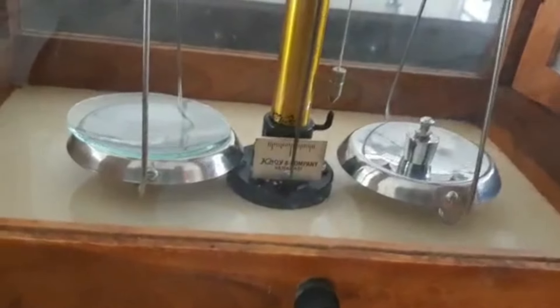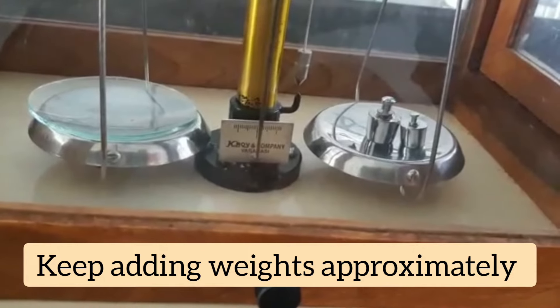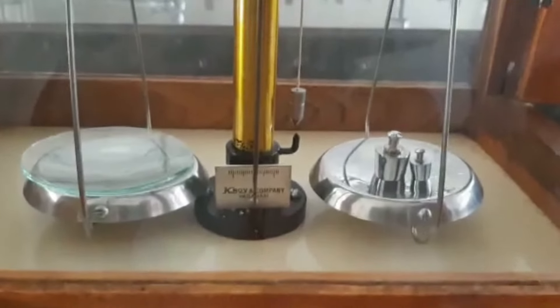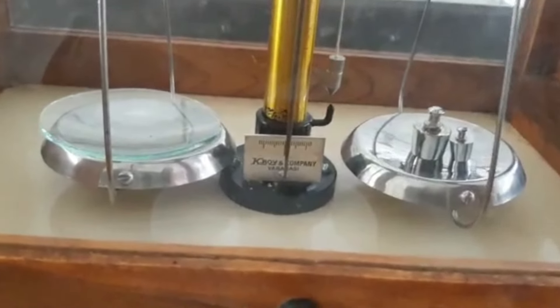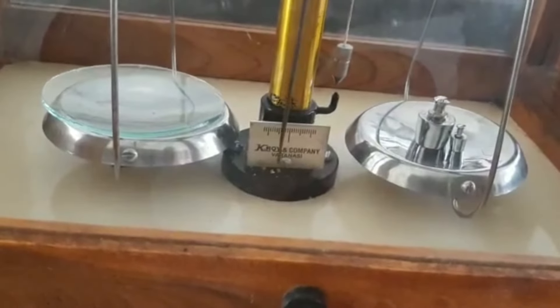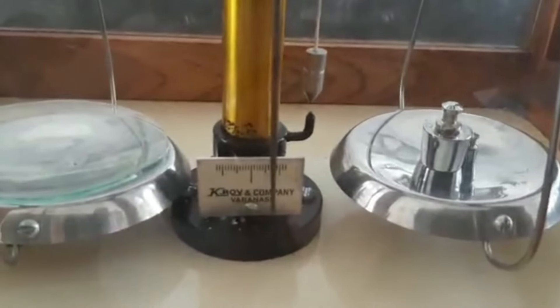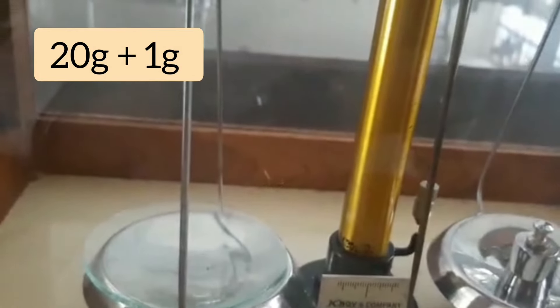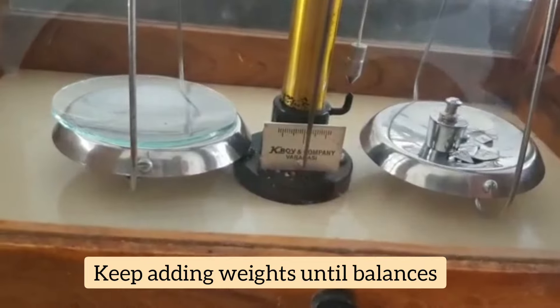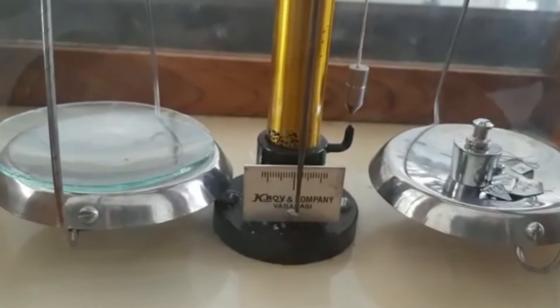The right side is still lighter, so I add 10 grams more — now it tips too far, so I add 5 grams, but that is still too much. I remove it and try 2 grams — that is also less, so I add a 1 gram weight. Now I make the final adjustment using milligram weights, adding 500 milligrams. The pointer is no longer moving, which means the balance has been balanced and the weight of the watch glass is determined.